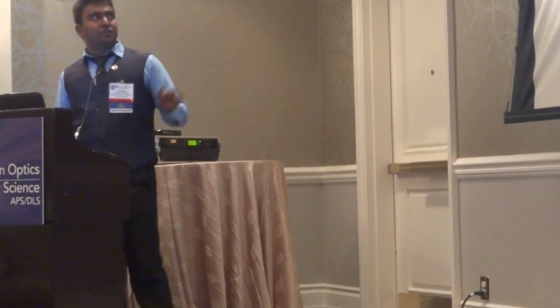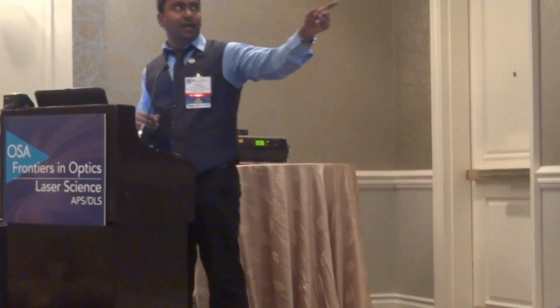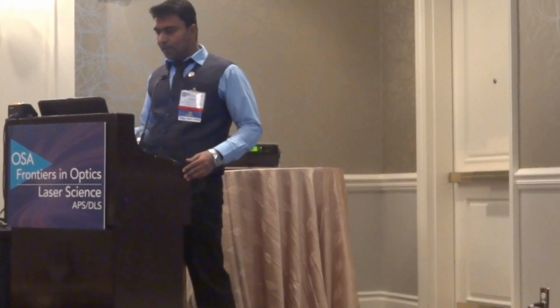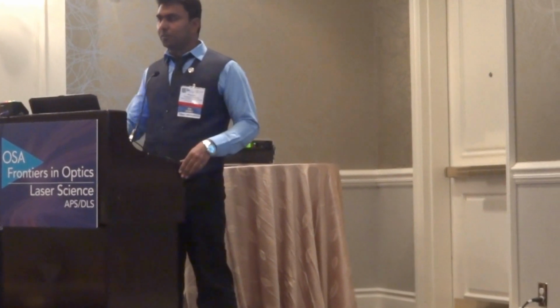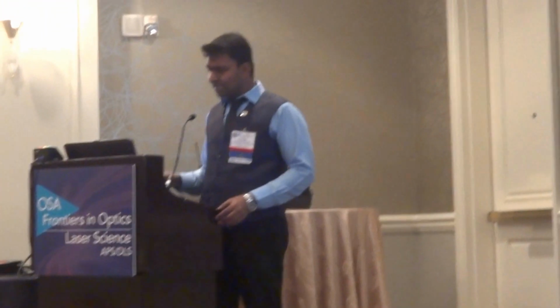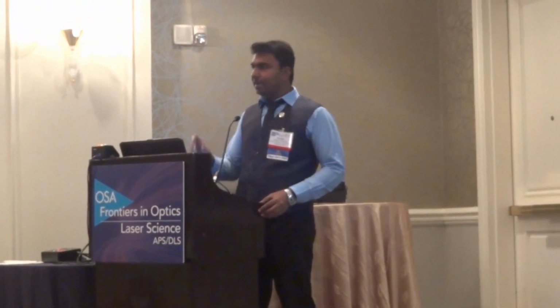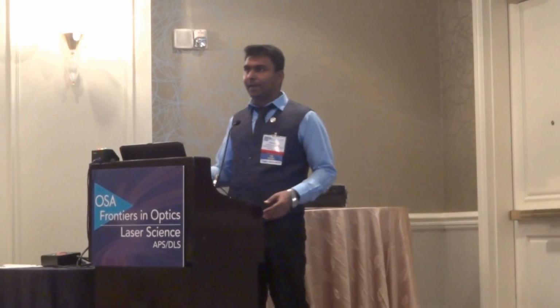The general thing we use for reconstruction, once we have the hologram recorded, is the Helmholtz-Kirchhoff integral. Here, there are three things you need to keep in mind. One is the distance between the pinhole and the sample, that is z, in our case 2 millimeter, and the distance between the sample and the hologram, that is 27 millimeter, and finally k, the wave number, 2 pi by lambda.